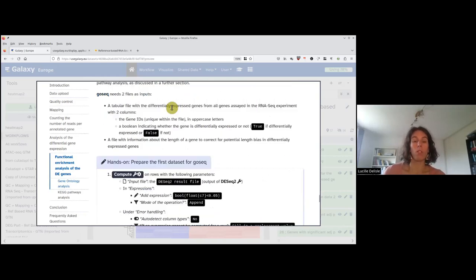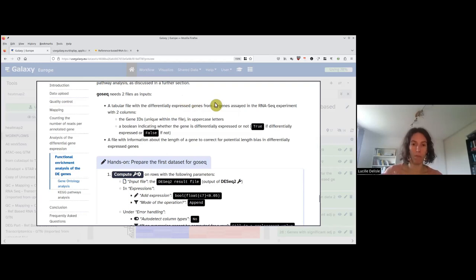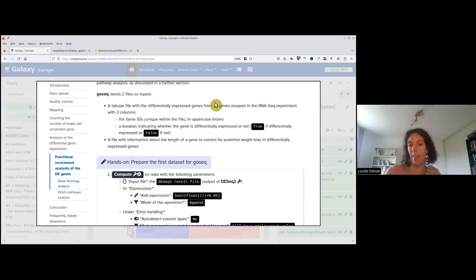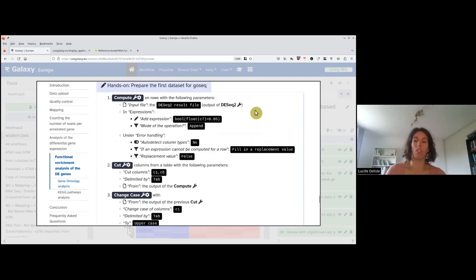GOSeq requires two input datasets. The first is a tabular where the first column is a gene ID in uppercase, and the second column is a boolean saying whether it's differentially expressed (true) or not (false). The second file GOSeq requires is a file with information about the gene length, to correct for bias. We will first generate the first input — the true/false table — using the DESeq2 result.